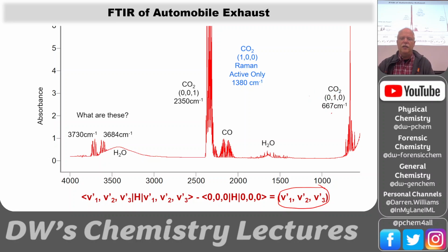This is the second vibrational state for CO2, this nu 2, excited here. And we see some rotational structure because this is in the gas phase. We see some water, and we see rotational structure. We see carbon monoxide with its rotational structure.